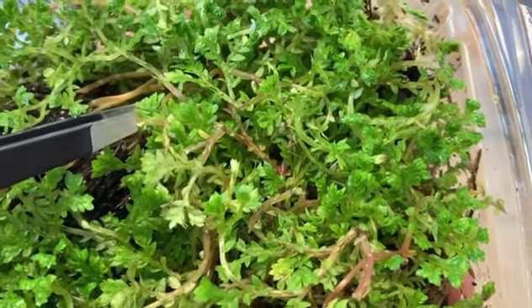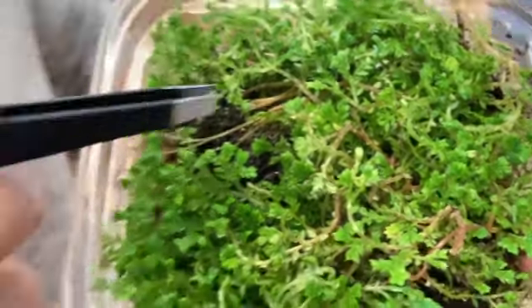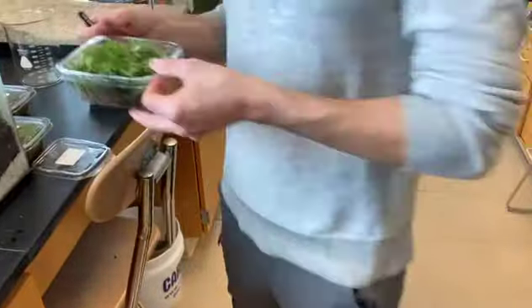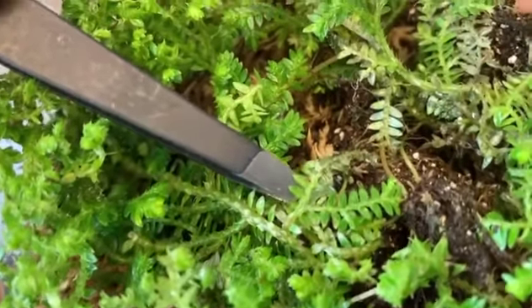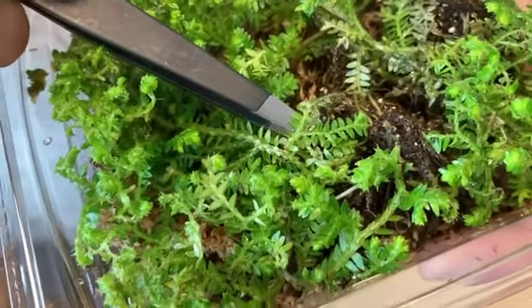And you're going to want to take that individual leaf and put it under a dissecting microscope to see the fact that it's got no vein, or a singular small vein to it, no branching. This is true for different species of Selaginellas that also have only a single vein. I like this species a lot because you can see the white indentation on these leaves where the vein is present.